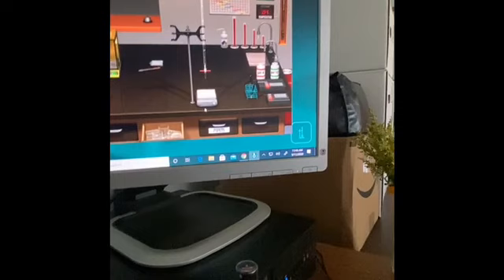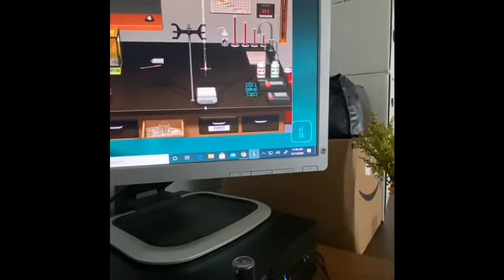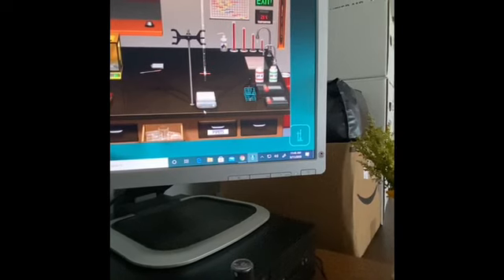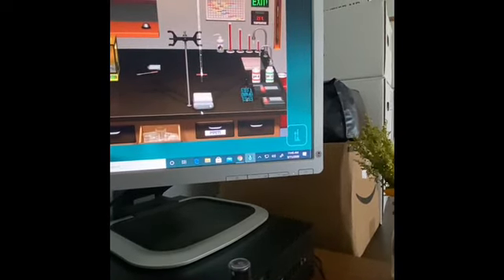Step number 5, once you've completed the 3 reagents and return them to the stockroom, click on each bottle to return it to the shelf. Fill out the data tables and then answer questions 6 through 10. And that's it.